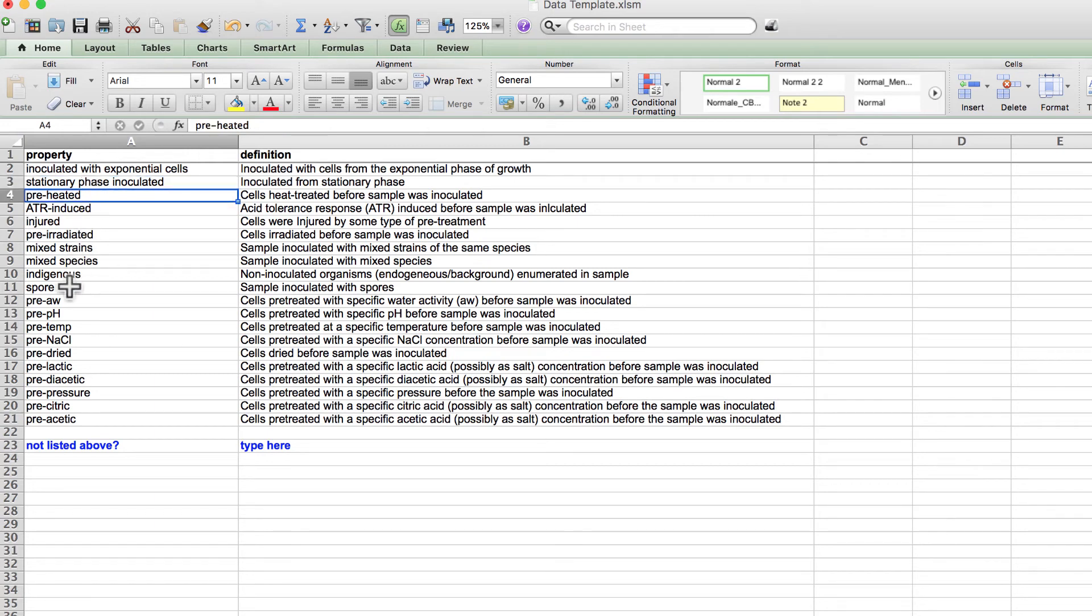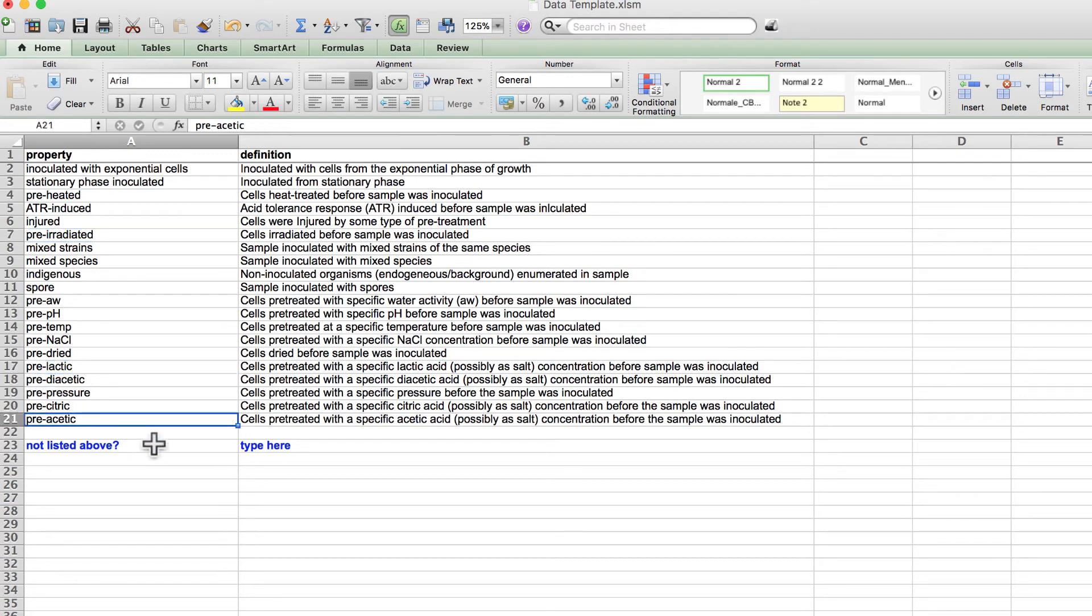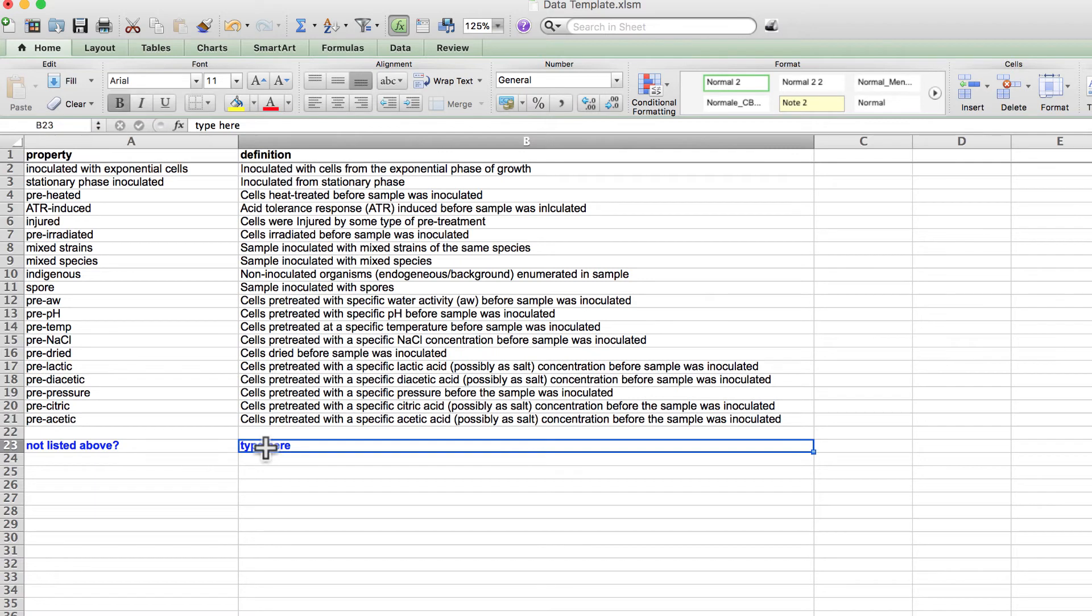Maybe the bacterium was pre-treated with heat, or with radiation, or with various acids. If one of these properties is not relevant to your experiment, then please type the condition into the sheet at the bottom.